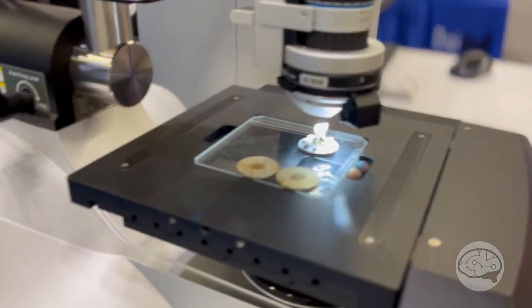It's fully motorized XY and Z with one micron resolution on the Z axis, and then with our confocal chromatic sensor we can go down to nano level resolution. As far as zoom ranges go, we operate from zero to about 7,000X.